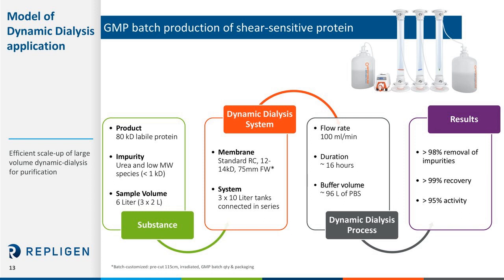So I'll look at a model of a dynamic dialysis application to help you understand how this translates to your practical application. As Danny had mentioned, every application is going to be different, and every application will need process development. So it really is a good place to start with a model and then go from there to fine-tune it to your particular application.